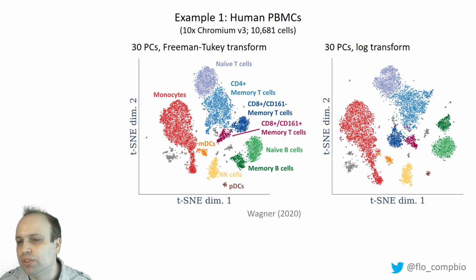Here there's a few, these are probably doublets or something. They're a little bit different, but like I said, it does the job. Again, from a theoretical perspective, I think the square root transform is better, makes better use of the signal in the data, but either way works.